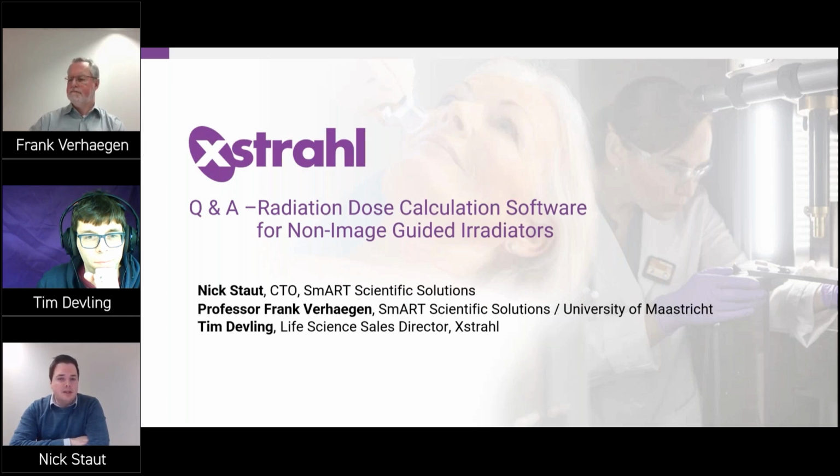But one thing you always have to take into account with Monte Carlo simulations in general is that out of field calculations, which would be the case if you put a shield above the well plate, need a lot more particles to get good statistics under that shield.